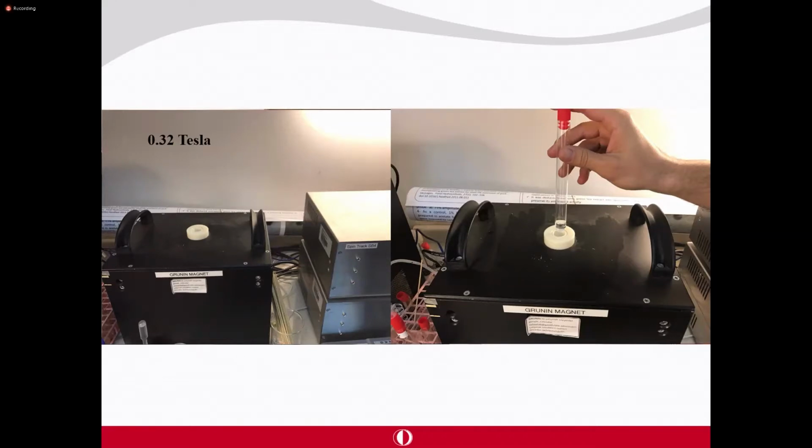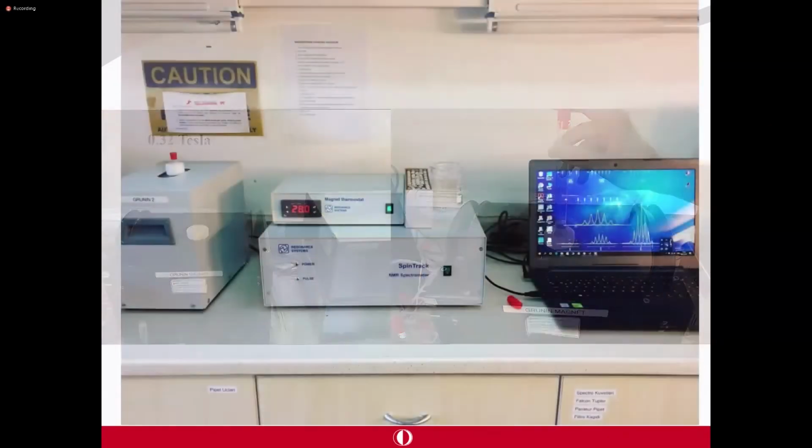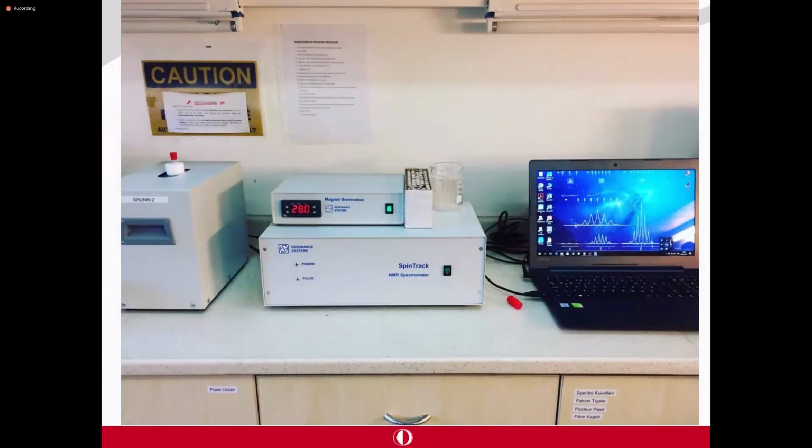We can obtain information about the water activity, because the water binding is going to be one of the pieces of information that we get in such a system. Okay, and let me show you another system.